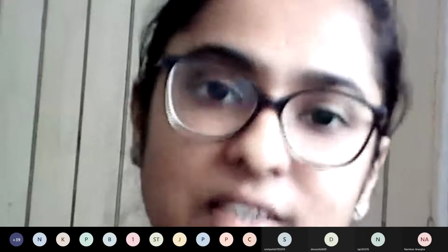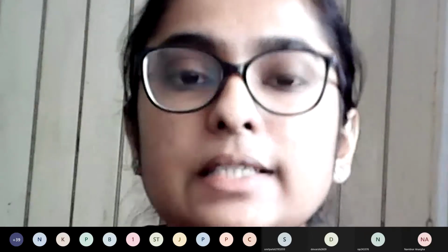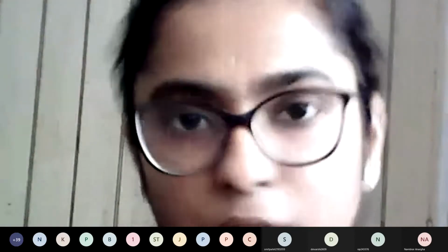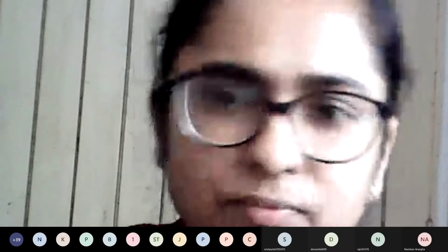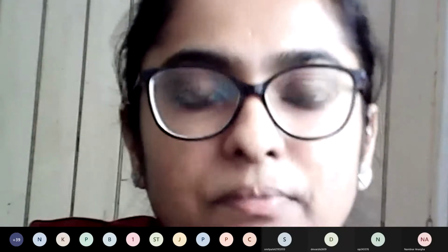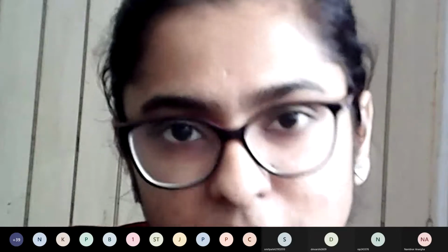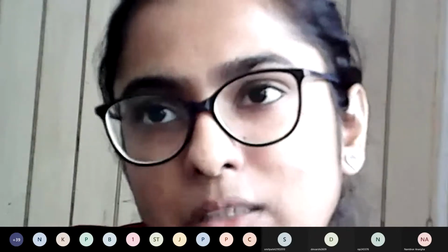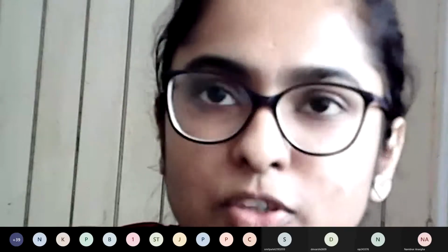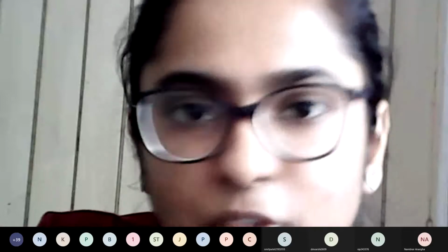What is that? In this case, iron is a metal that is capable of forming a complex with EDTA at normal room temperature. It can form a complex. It's fine with iron. But chromium is pretty inert at room temperature. If you simply mix it with EDTA, it won't bind. It is like one of those very patient people, so it won't easily bind.